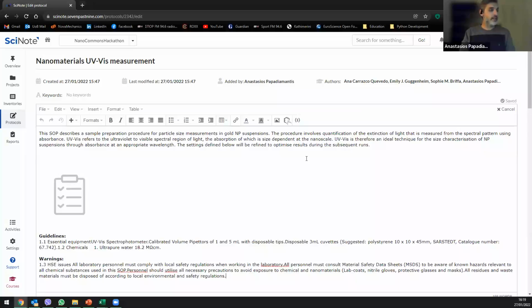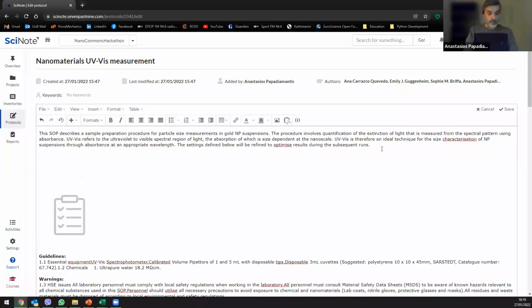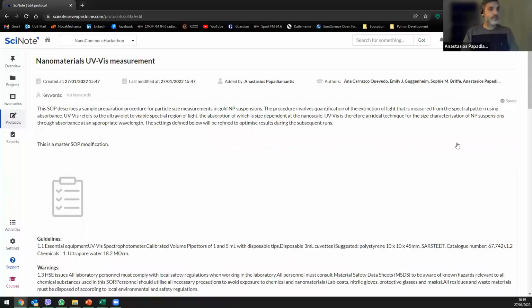So if I modify this, this is master SOP modification, and I press save.